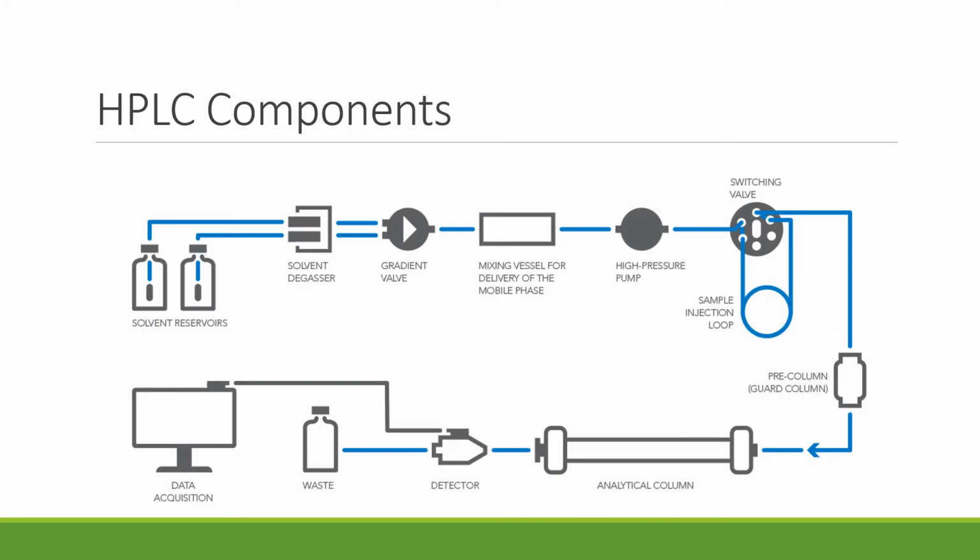All right, so these are the basic components of HPLC, and flow through an HPLC system is going to begin in the solvent reservoir here. And these solvent reservoirs contain the solvents used to carry the sample through the system. This is the mobile phase. And these solvents get filtered usually through an inlet solvent filter to remove any particles that could potentially damage our sensitive components of our instrument, and can be mixed to increase or decrease the polarity of that mobile phase.